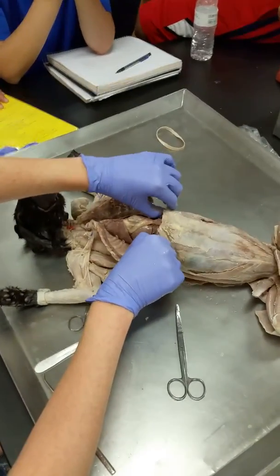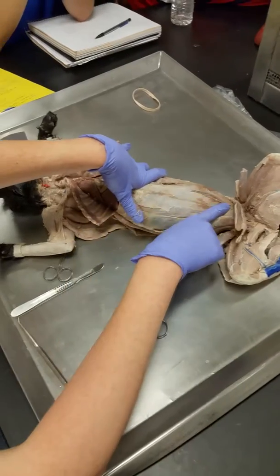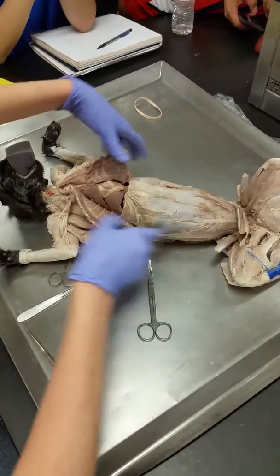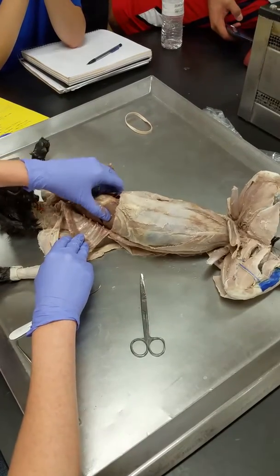Still intact, so I didn't cut through it. Okay. And then what we're going to do now is open up the abdominal cavity in kind of the same way. So we're just making windows so we can pull it open and we can see everything.